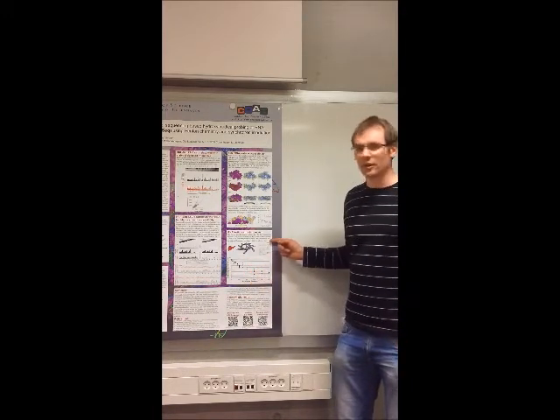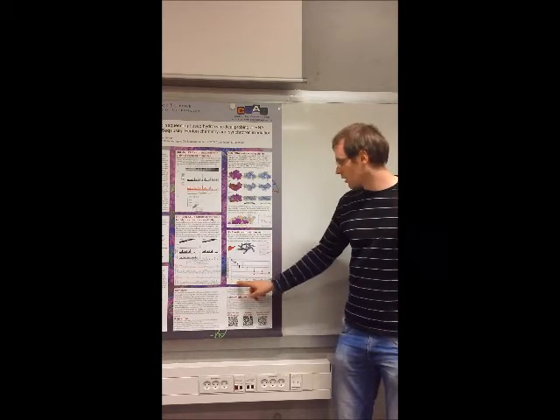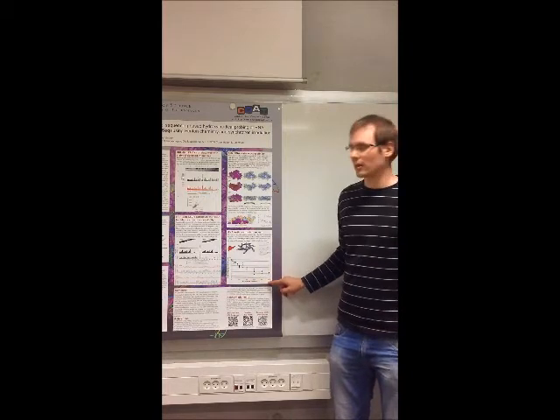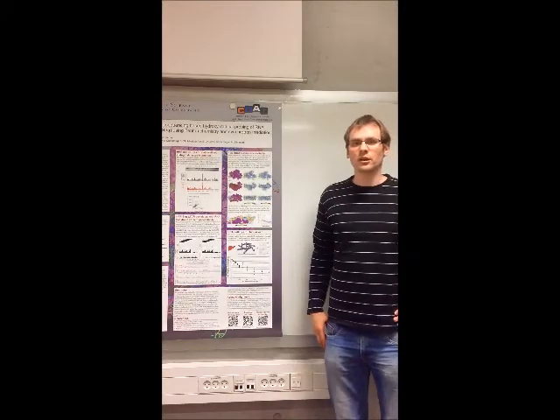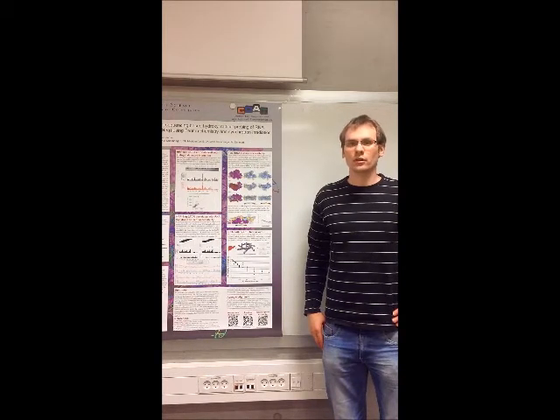Quality of our RNA decreases with increasing irradiation time over a range from 0 to 1000 milliseconds, indicating that the irradiation worked as intended. Currently, we are preparing the sequencing libraries and will analyze them in order to find novel RNA tertiary structure which exists in vivo.